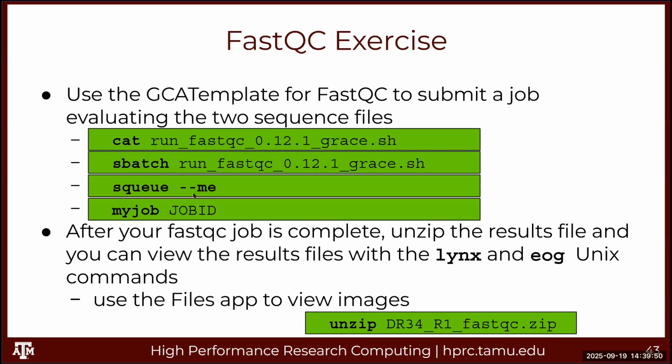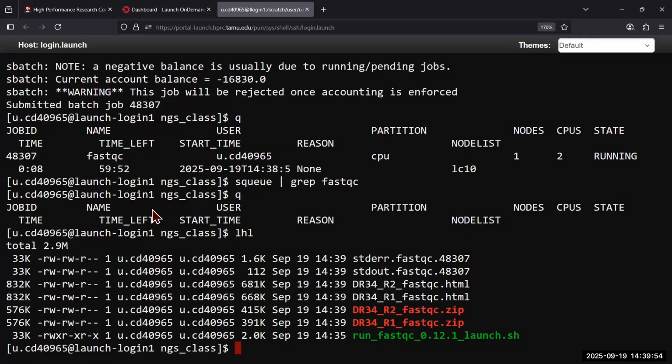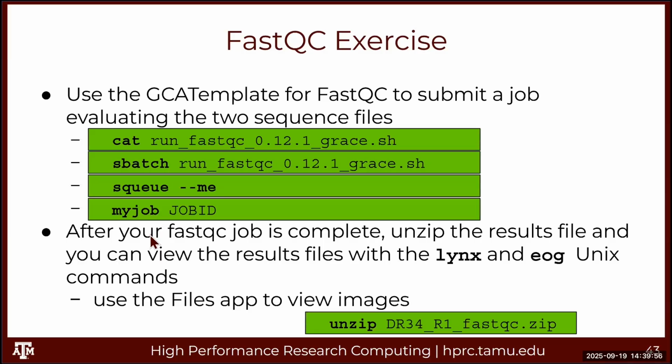And then when you get done, it should look like this. So the second line, SBatch, submits it to Slurm. And then Slurm's going to read those SBatch parameters and look for a compute node and then put your job on the compute node and run.